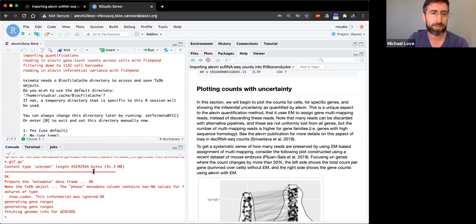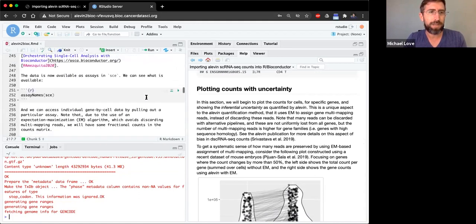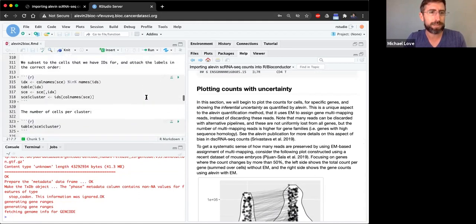Okay, yeah, so this is more typical speed on the left-hand side. Let me just run up until where we are.